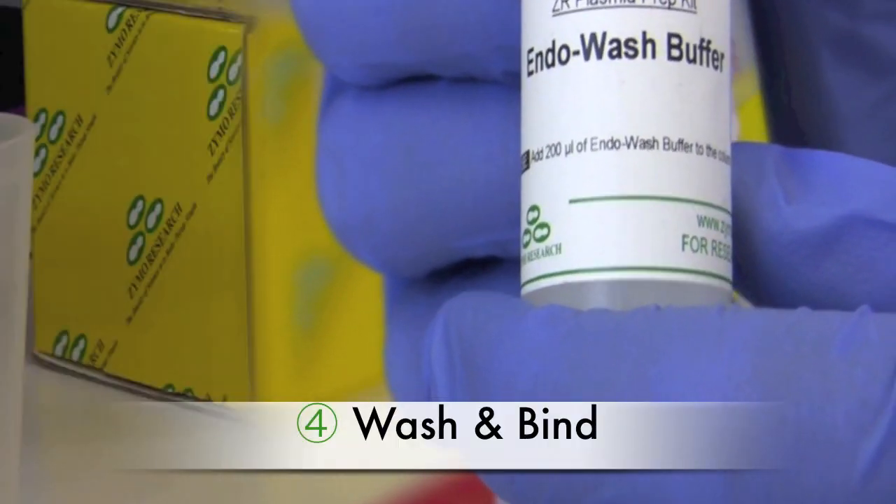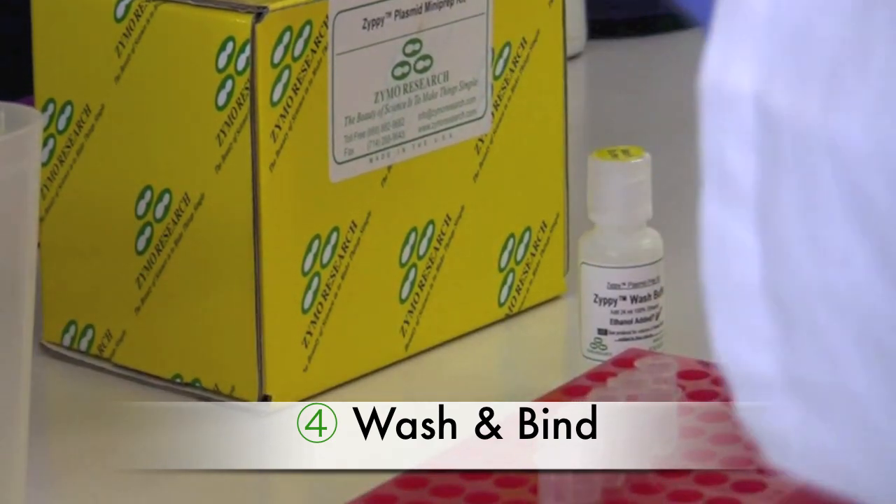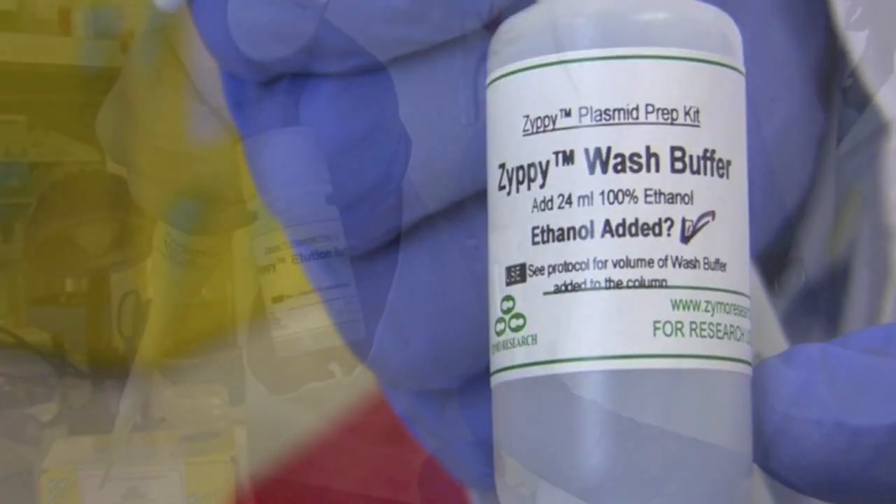After passing through the supernatant, wash with 200 microliters of endowash buffer, followed by 400 microliters of Zippy wash buffer.